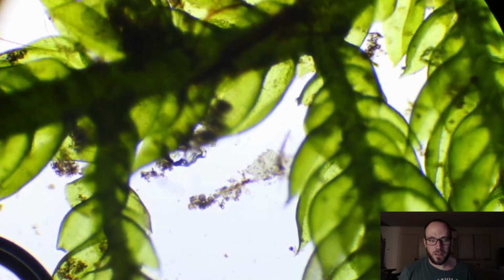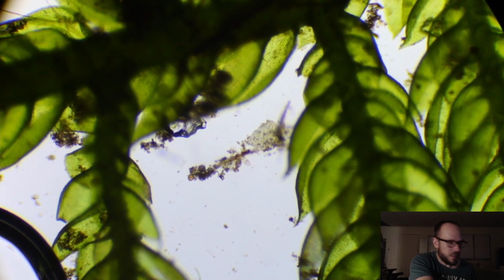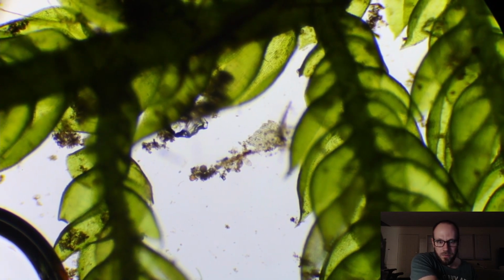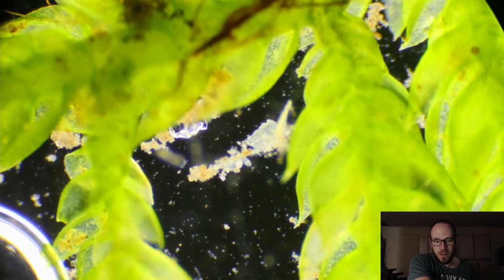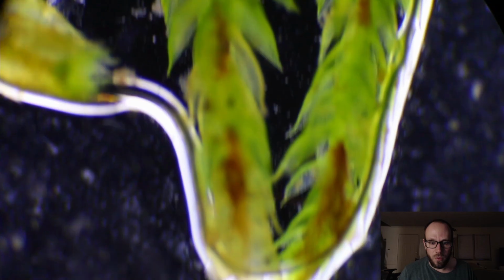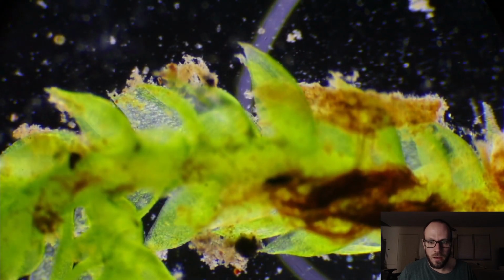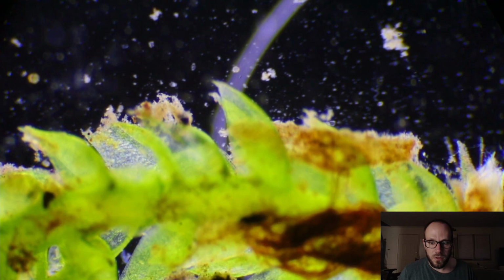I've wanted to do stuff like this for the longest time. The idea of live streaming it didn't come to me till kind of recently. But it's still the coolest thing to me. I've been nerding out so much. And the day I find a tardigrade, I'm going to nerd out even more, because I'm going to want to keep it alive, give it a name, and have it make babies. Or something, I don't know.